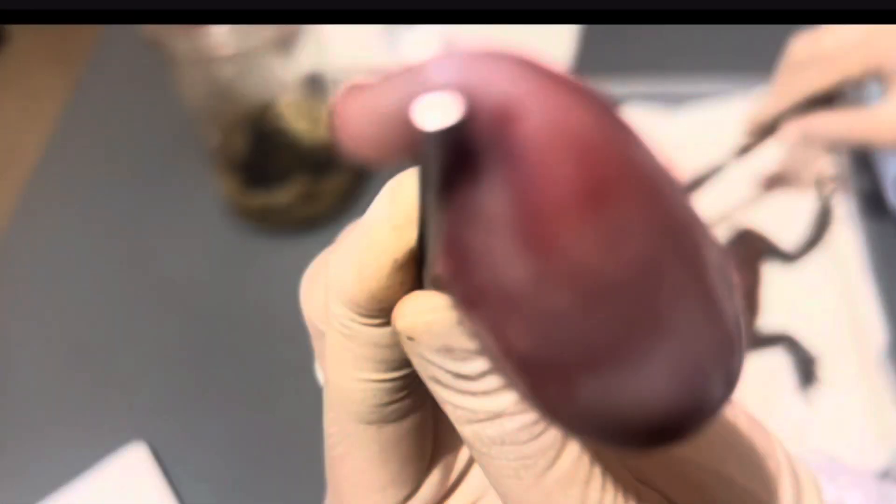This large bean-shaped sack is the stomach. Compared to humans, there's not much difference between the two. And for the function, this is where digestion starts.